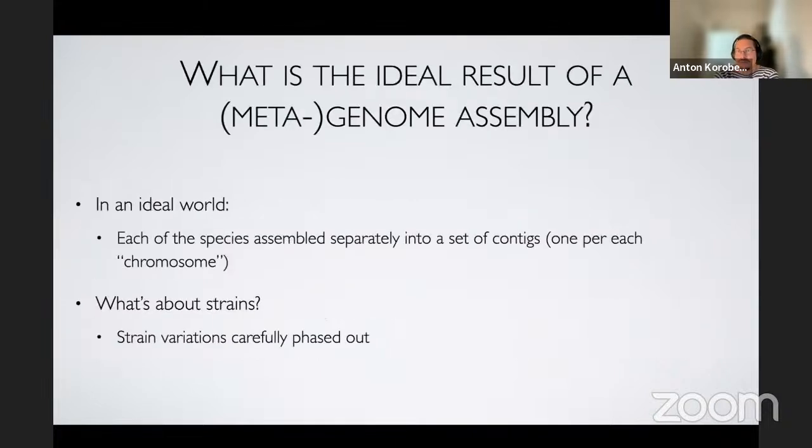Before we start talking about the tool, let's briefly talk about why we actually need these assembly graphs. That's quite an interesting question, because traditionally the whole of bioinformatics and the results of genome assembly were mostly centered on contiguous sequences.